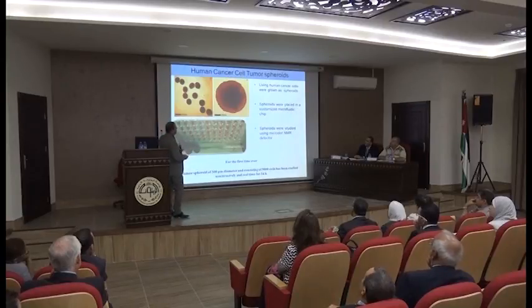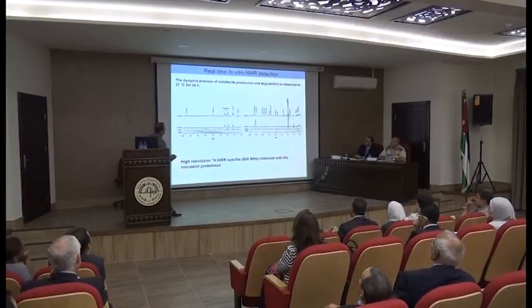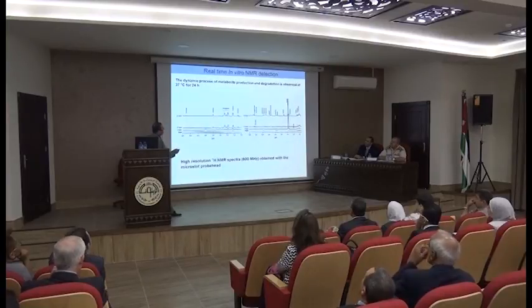And we took it to the NMR sensor. They are living, they are in the case where they are active. And we make the NMR measurement, just dump the result directly to show you. Just one measurement, it's the real-time measurement. So real-time in vitro NMR detection.